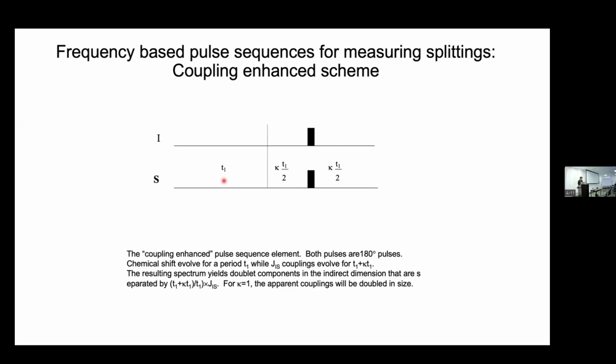Okay, so maybe we can walk more rigorously through the product operator formalism, some of this. But I'm also going to teach you my system for analyzing pulse sequences, which is the poor person's system that I think is interesting. See if I even remember how to do it. It's been a long time.